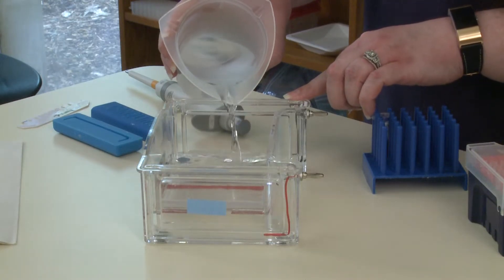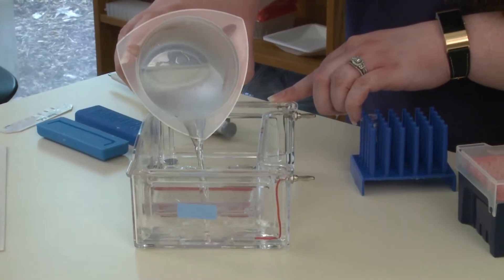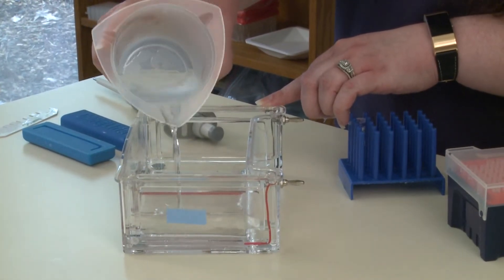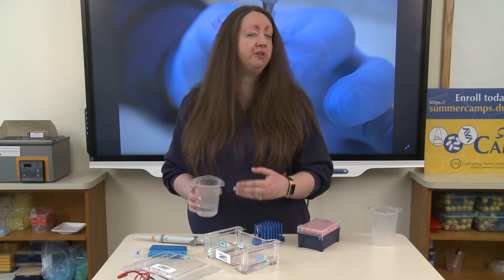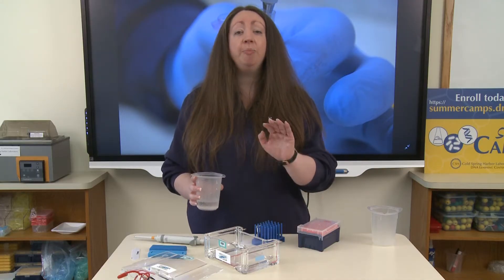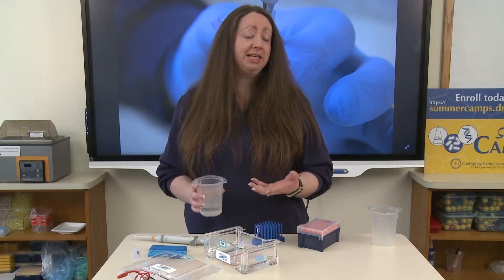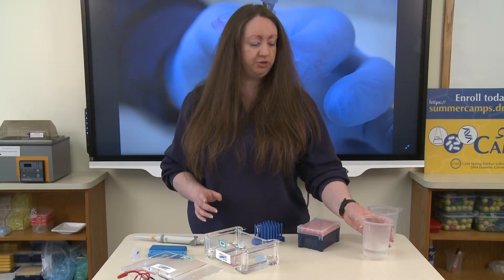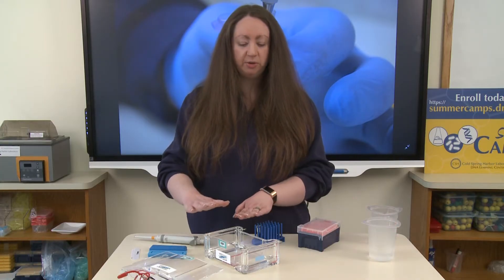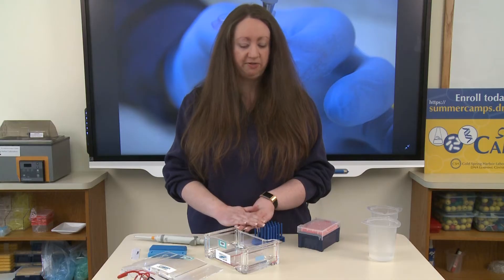The reason being is the electricity — the current that we're going to run through here — is going to take the path of least resistance. So if you fill your gel box with a lot of buffer, your current is going to run up and over your gel as opposed to through your gel. Therefore, your DNA will not mobilize and move as far through the agarose gel. So just enough buffer to make sure that the gel is submerged and you cannot see the wells peeking up from outside of the buffer.